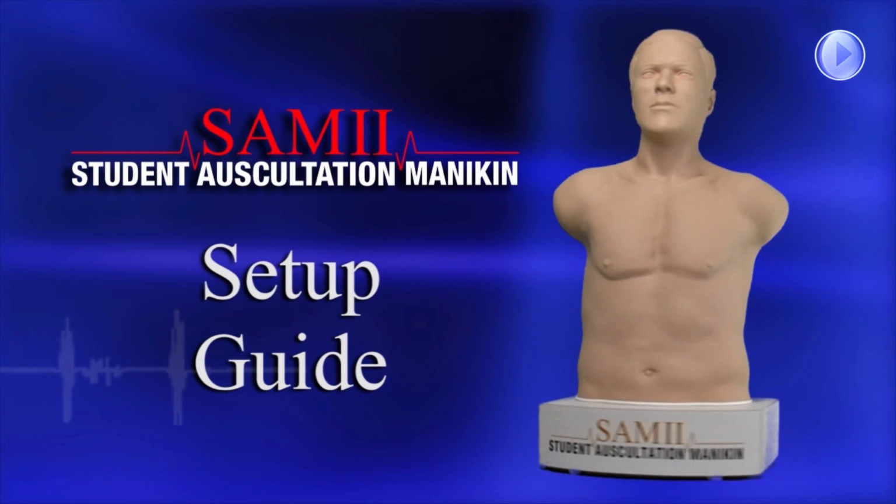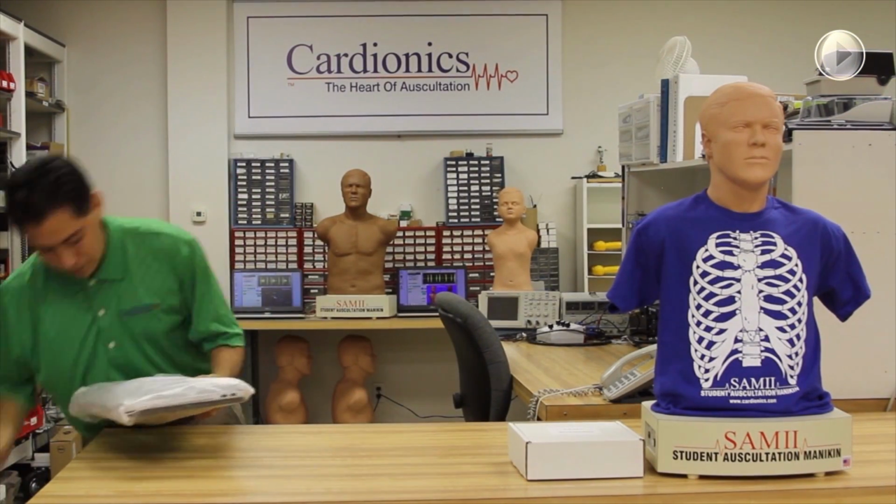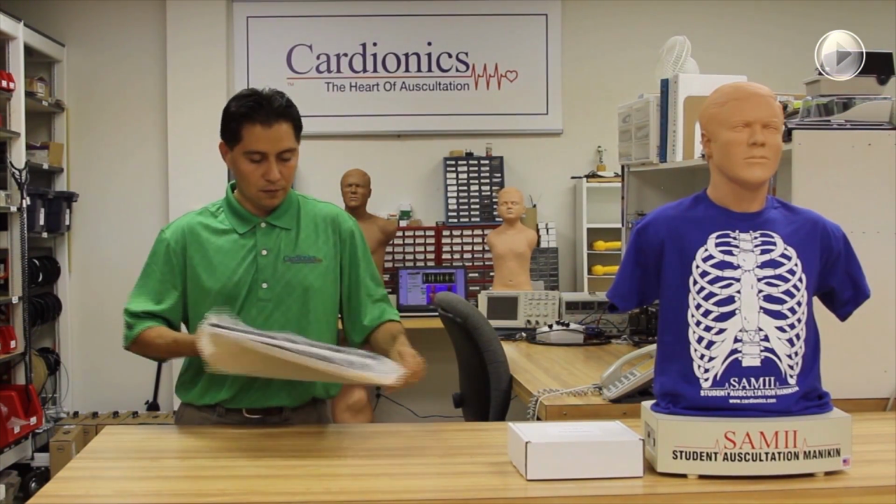Welcome to the SAMII Setup Guide. By now you will have unpacked and verified that all components are present and in good condition.